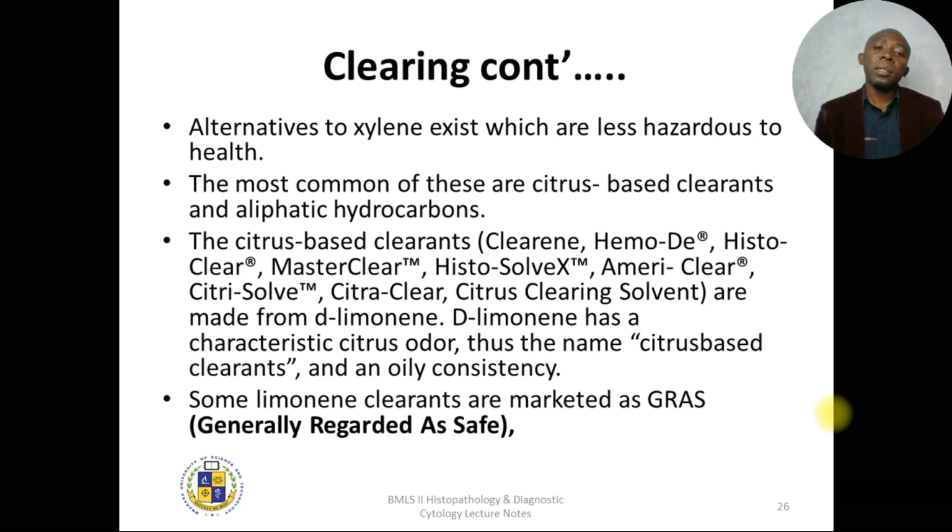D-limonene has a characteristic citrus odor, and that's where the citrus-based clearant gets its name, because that odor is similar to that of citrus fruits, like orange and lemons. The smell of an orange is similar to that of limonene.